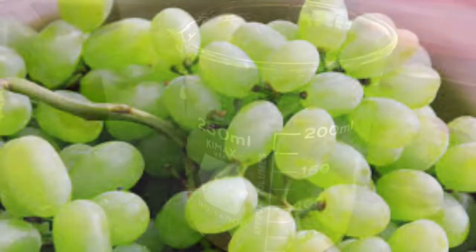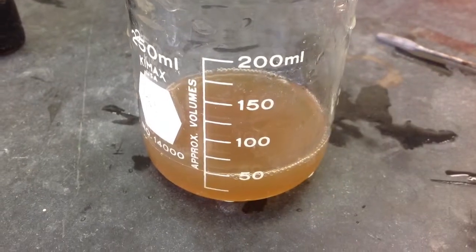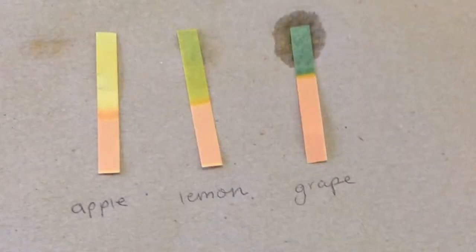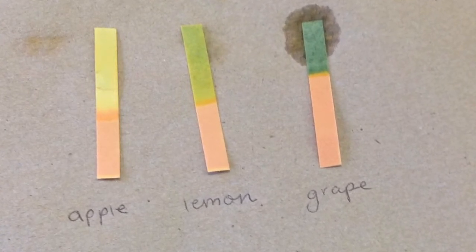My third and final test used grape juice. 3.7 milliliters of NaOH was used in order to reach an equivalence point of between 9 and 10. Here are the used pH strips laid out at the end of my 3 trials. Very pretty as well as informational too.